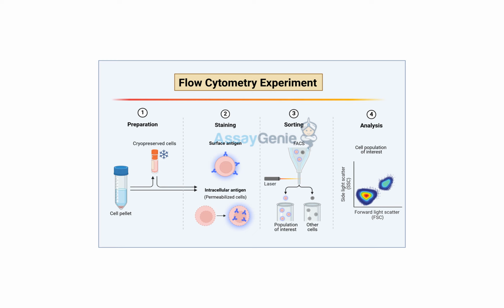So it's kind of a trade-off then. You get stronger permeabilization, but you might lose some information along the way. Exactly. That's why choosing the right method is so important. It really depends on what you're trying to study. Are you looking at things that disappear quickly, or are you looking at stable structures? So it really depends on your research.